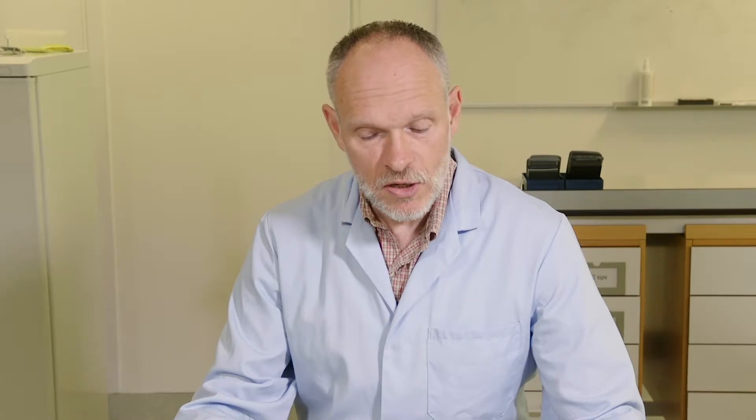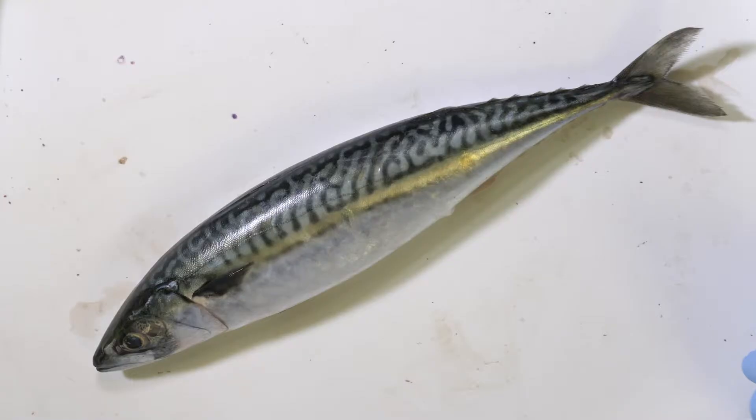The reason for looking for Anisakis in mackerel is in order to get an idea of the prevalence — the abundance and frequency with which we find these parasites in the fish. If you're undertaking this dissection in order to collect data about the prevalence or intensity of Anisakis in a fish population, then it makes sense to collect some data about the fish that you're dissecting.